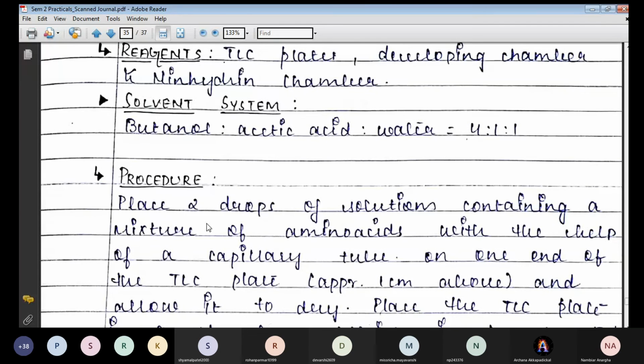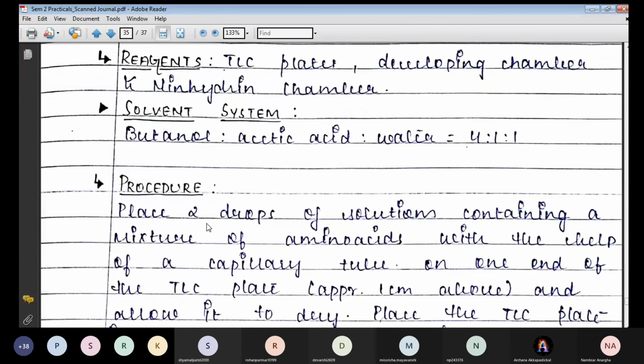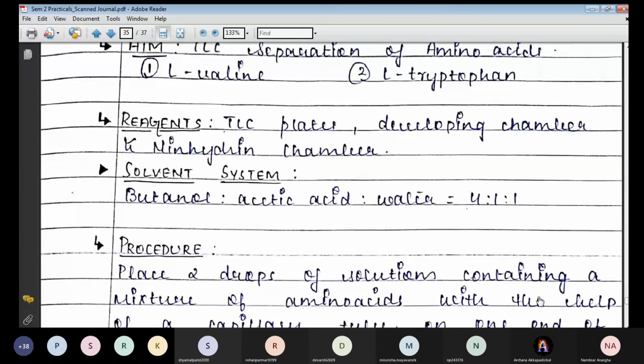What else do we have in our questions? Yes, the other question, this is a simple question. Principle of chromatography. Yes, it is visible. Just show me the RF value, other than TLC.